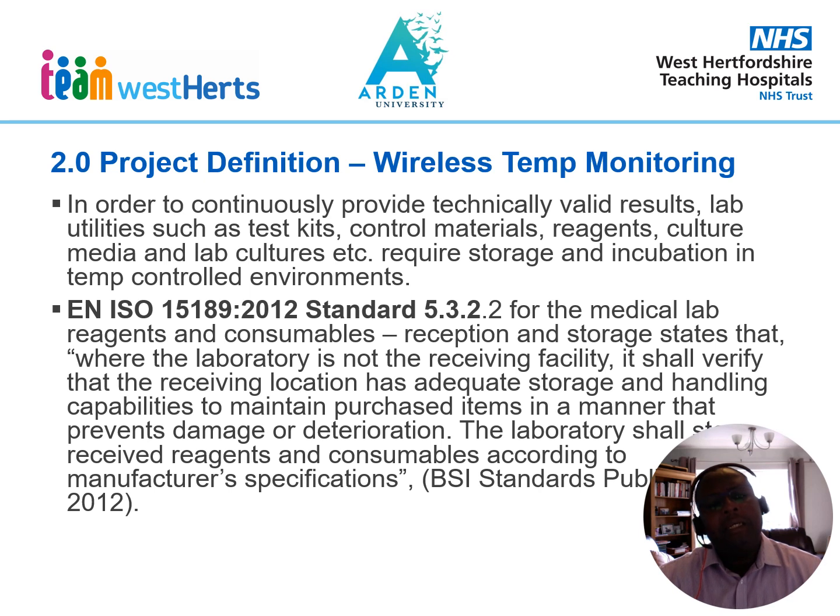This standard is quite important because when we have our UKAS inspections, we need to show evidence that the reception and storage of laboratory consumables is done within areas that are monitored, and that storage facilities prevent consumable damage or deterioration.